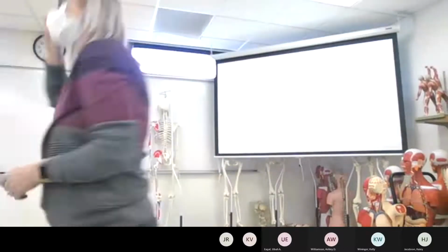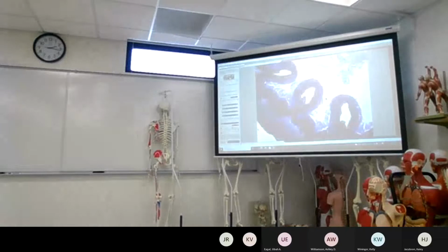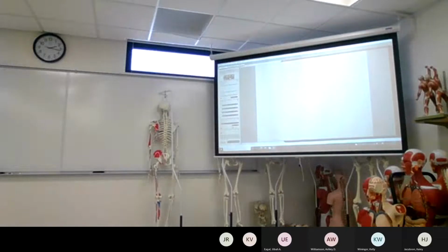All right, those cells on there. Now, did everybody find that? Now, if the other person has slide 5 out, slide 5, well, we'll get back to 4. I gotta find it on here. Come on, where are you? Oh, there it is. Okay.